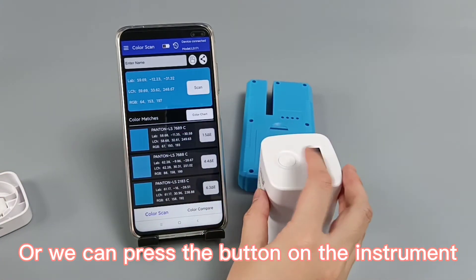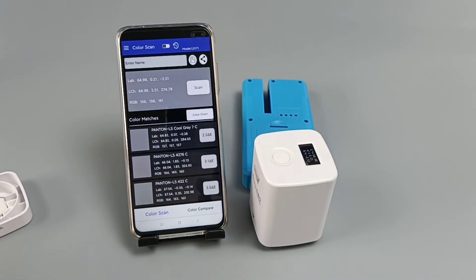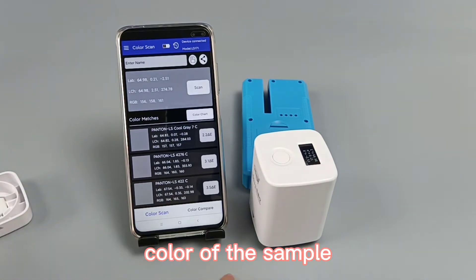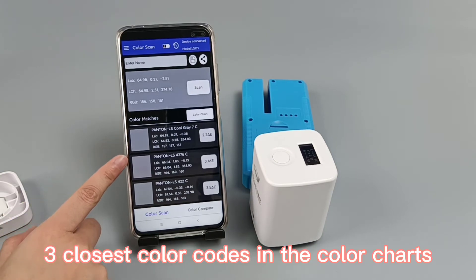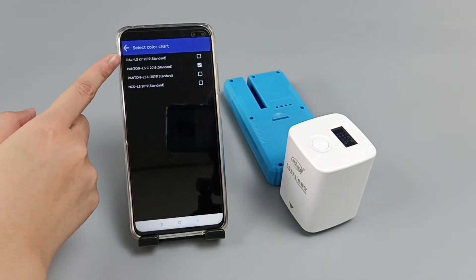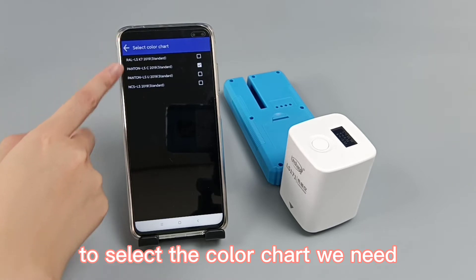Alternatively, we can press the button on the instrument. The app interface can automatically restore the color of the sample. It can quickly match the three closest color codes in the color chart. We can click the color chart to select the color chart we need.